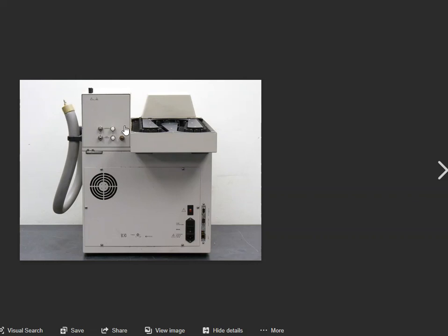You take this back out and then you can put your auto injector back on it, or you can manually inject onto the machine after that. So it does not need this to work, but it's using this almost like an auto sampler preparation step that can start feeding the GC sample after sample after sample.